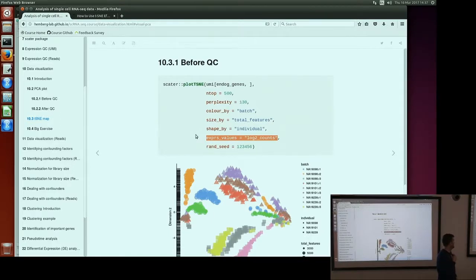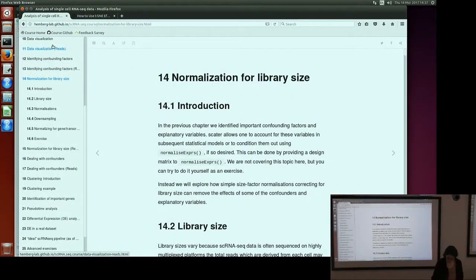Okay, we're going to cover CPM in the normalization chapter, so hopefully things that are not clear yet should become clear as Tallulah explains. Indeed, this is part of the discussion of building up from raw counts to normalized values downstream. We're presenting this, hopefully explaining what we're doing, but Tallulah's going to explain now more about the normalization and what we do. So, okay, now we're moving on to the normalization section.